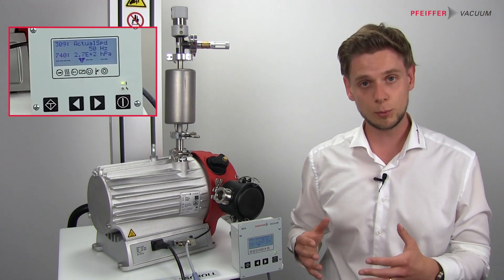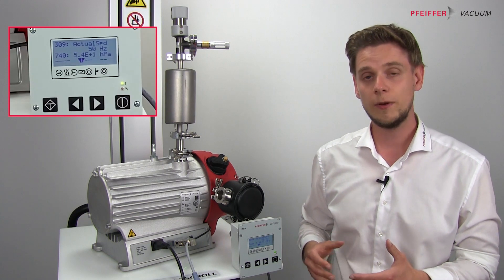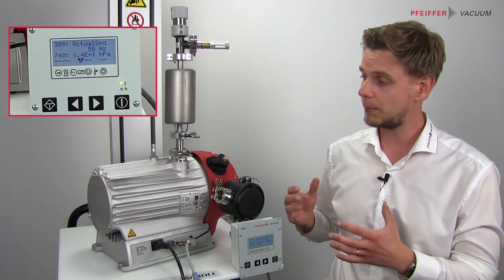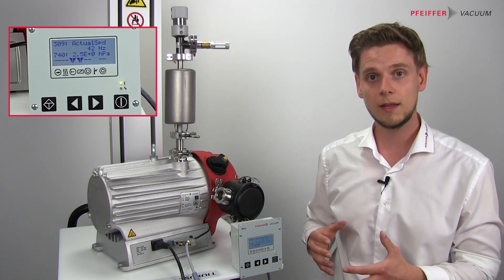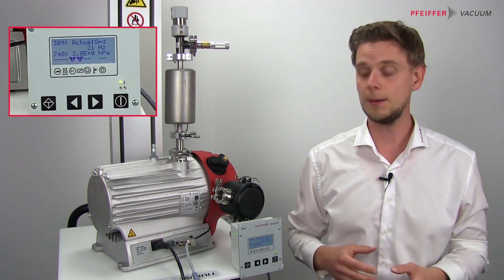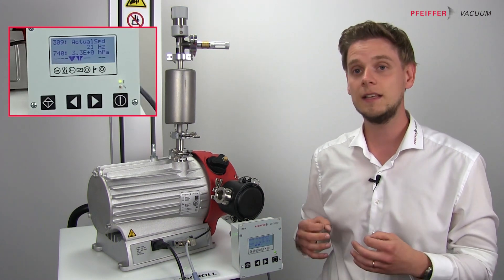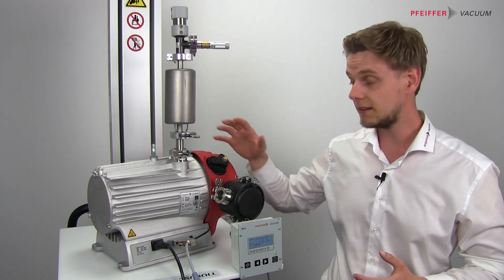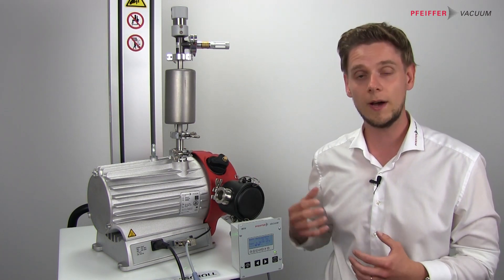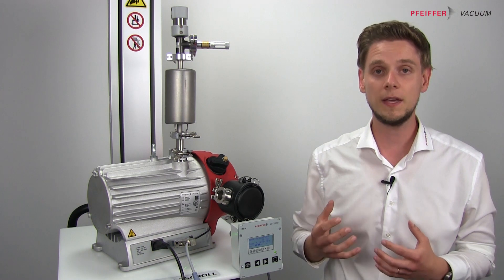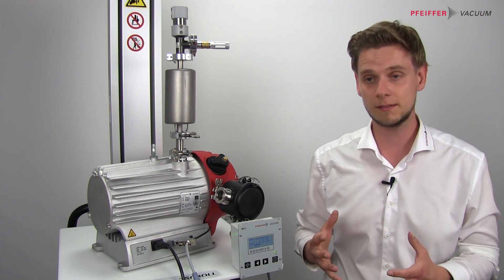Now we are in the boost mode with 50 hertz. When reaching the target pressure, the pump goes down to normal mode, and if the pressure is stable you can hear it. It switches into standby mode and it still runs. So it's very quiet and you might think it has switched off but it hasn't.